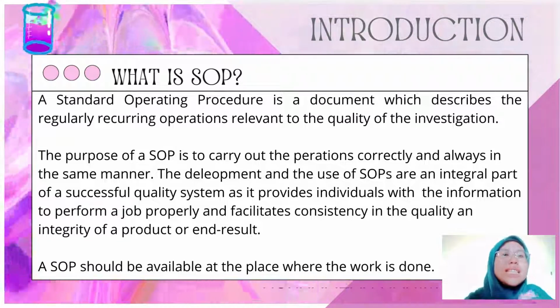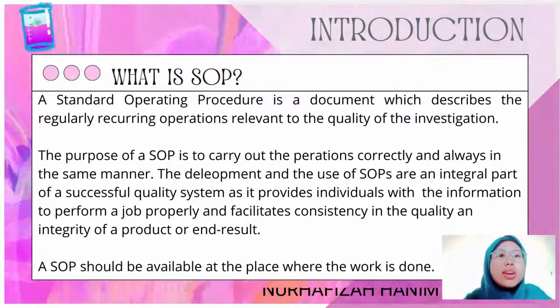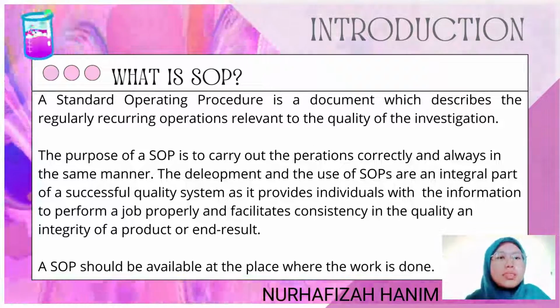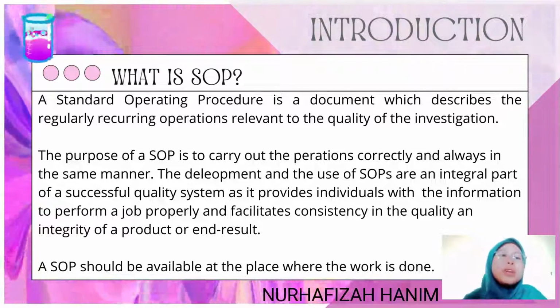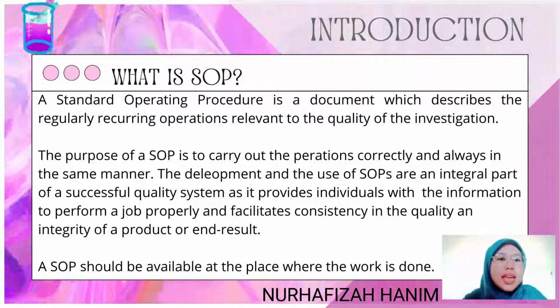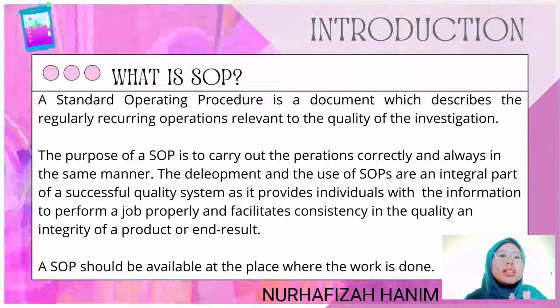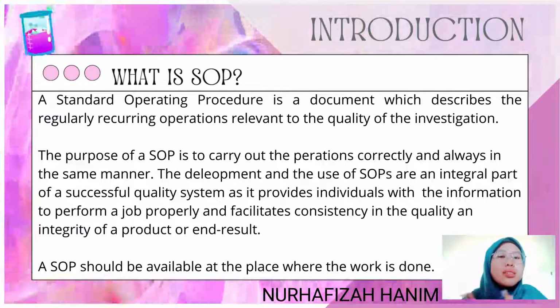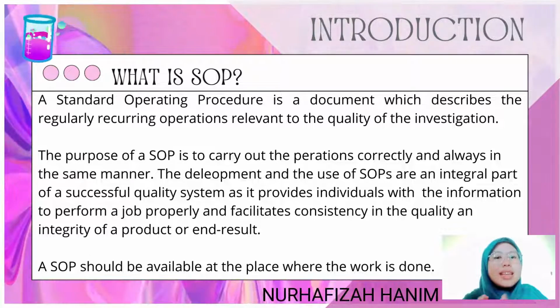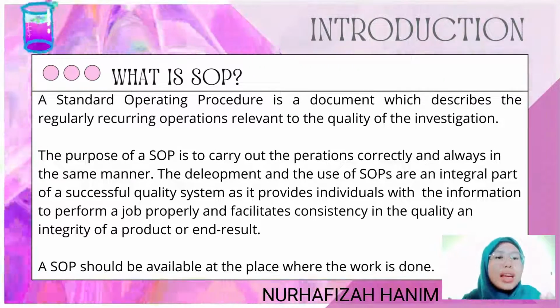A standard operating procedure is defined as a document which describes the regularly recurring operation relevant to the quality of the investigation. The purpose of a SOP is to carry out the operations correctly and always in the same manner. The development and use of SOPs are an integral part of a successful quality system as it provides individuals with the information to perform a job properly and facilitates consistency in the quality and integrity of the product and end result.